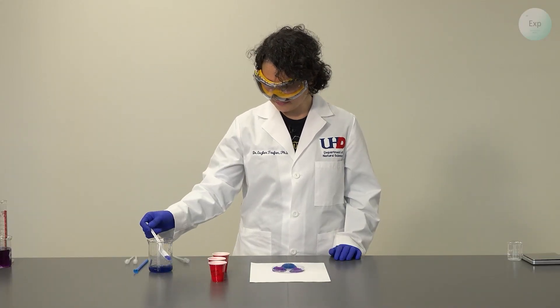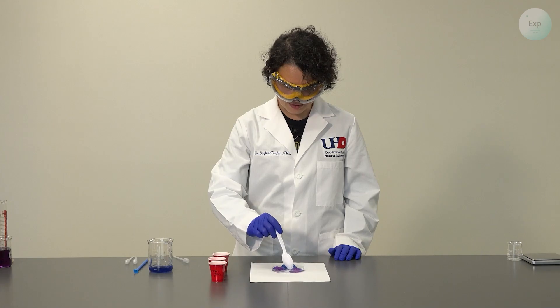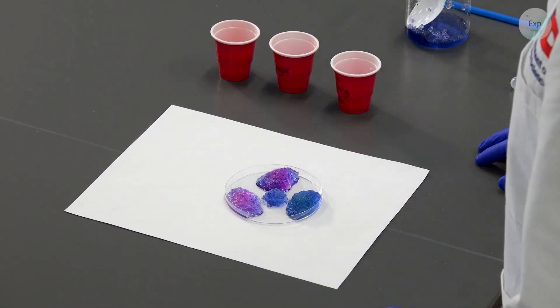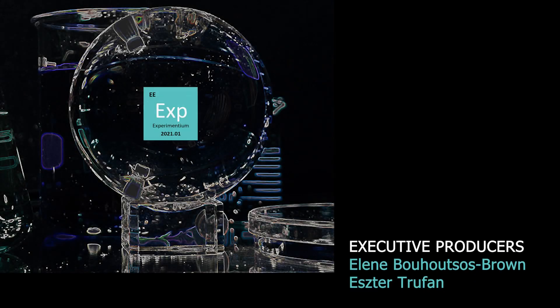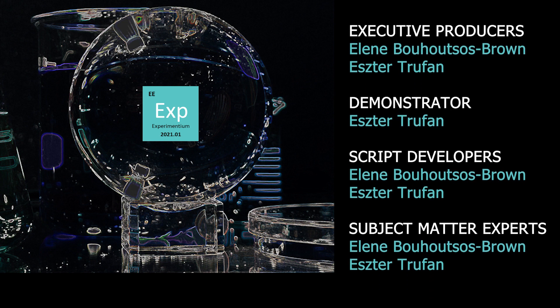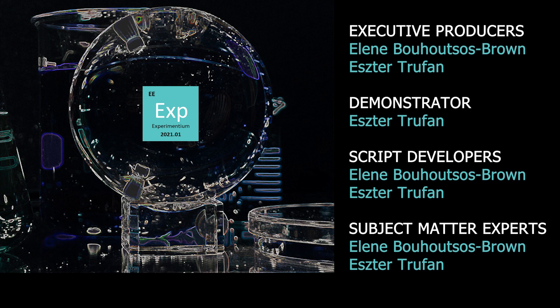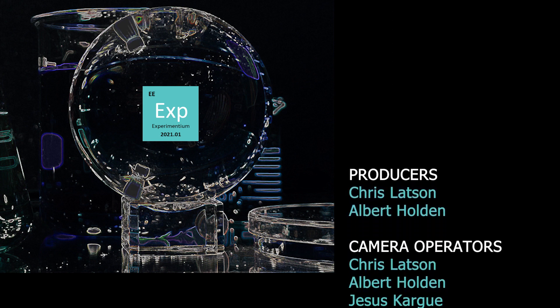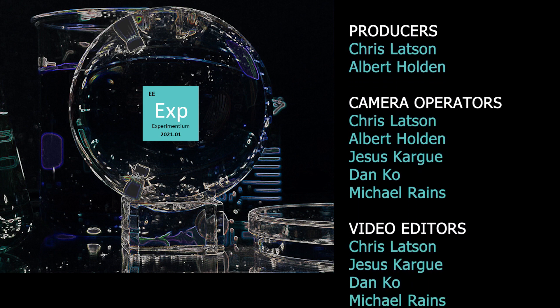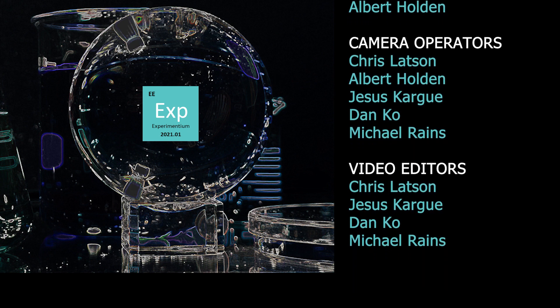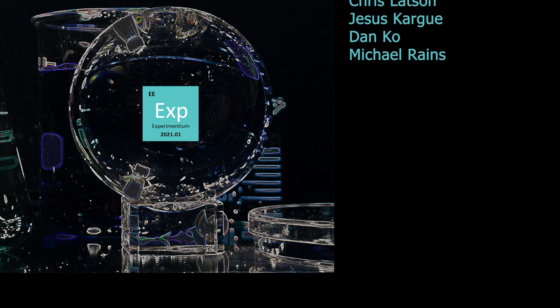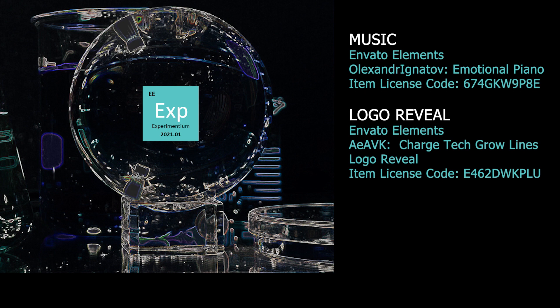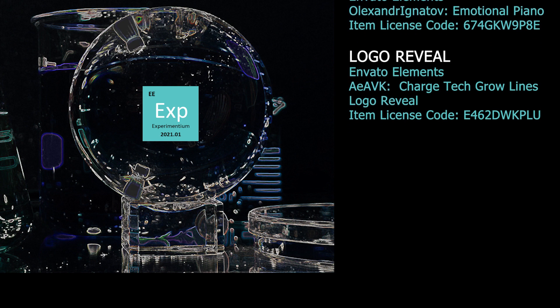And to remind ourselves what we started with, we can always add a little bit of the original indicator soaked polymer in the middle and we can see the difference. What do you think?